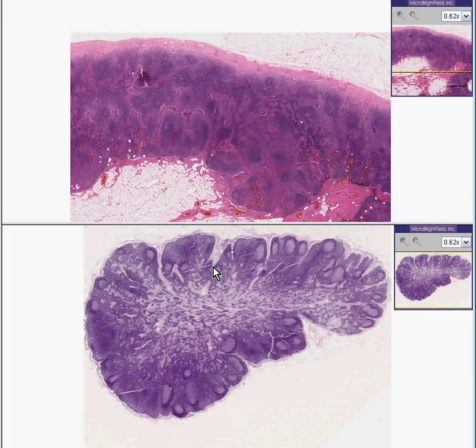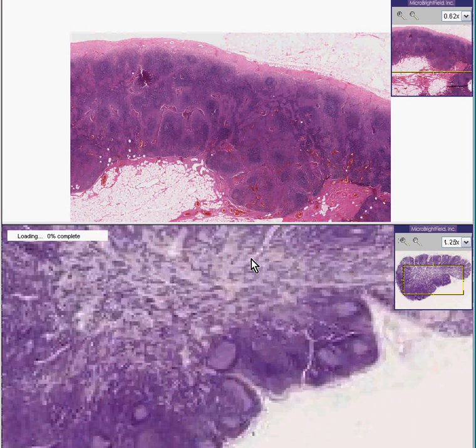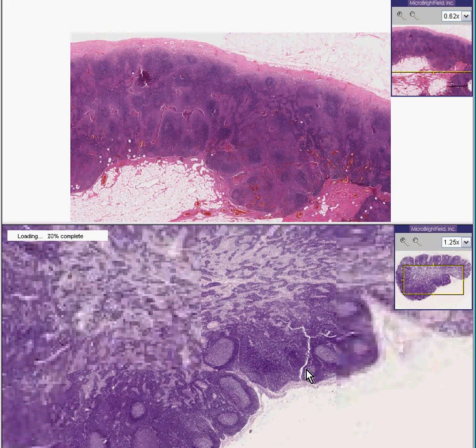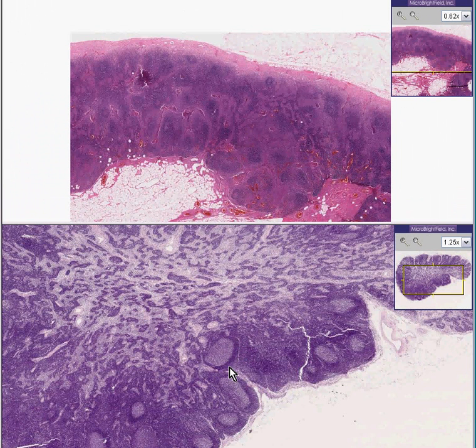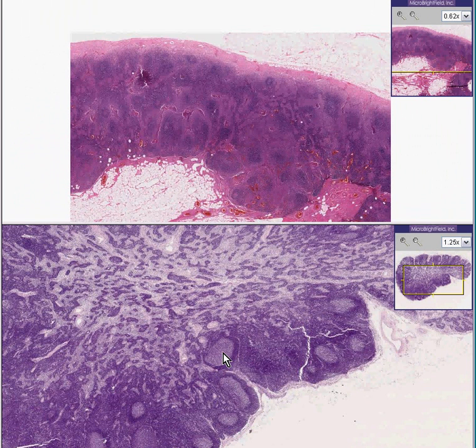Ladies and gentlemen, I direct your attention in the lower field to what I would call the world's most classically normal lymph node. You can see that the cortex of the lymph node chiefly contains secondary follicles in which you have germinal centers, which are lighter on the inside, and the mantle zone on the outside of lymphocytes which are darker. The reason why they're darker is that the lymphocytes on the inside have more cytoplasm relative to their nucleus.